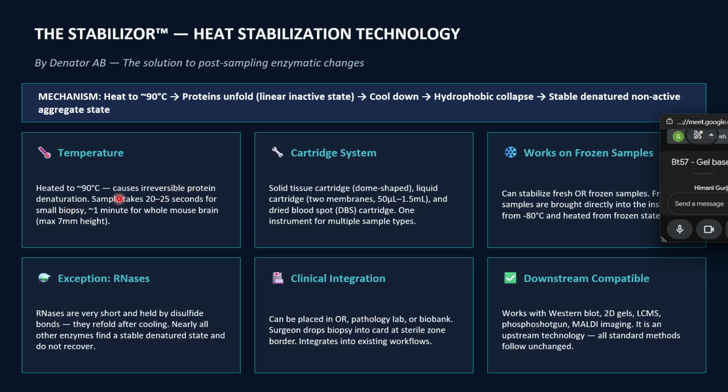So although in your external processes you will ultimately be degrading the protein, right? Like denaturing the protein, not degrading. So accordingly, the samples take 20 to 25 seconds for a small biopsy, and you need to heat it first. That's the first condition, temperature.